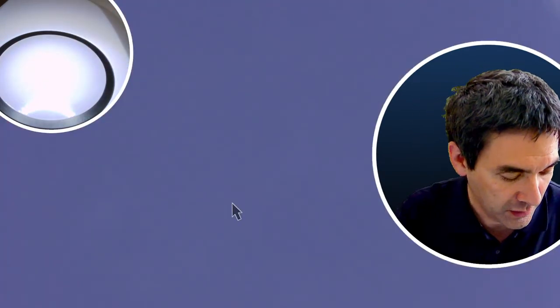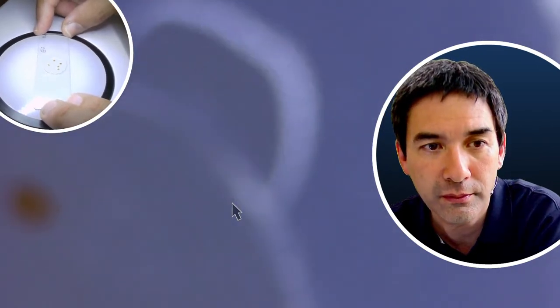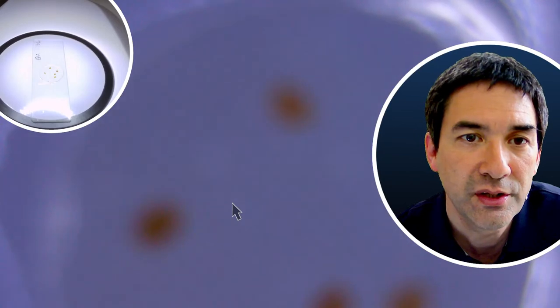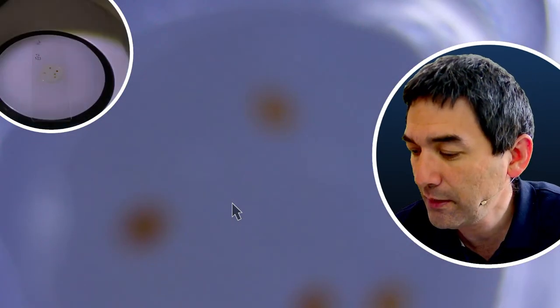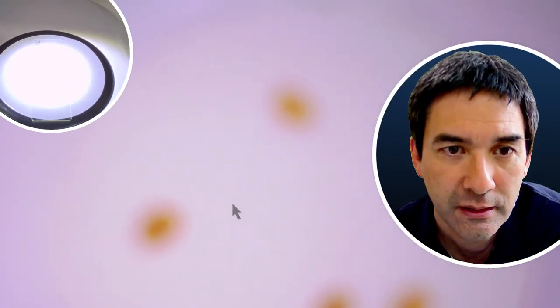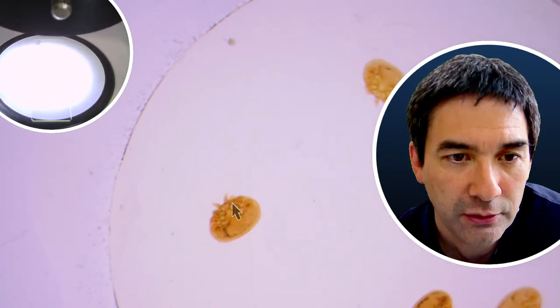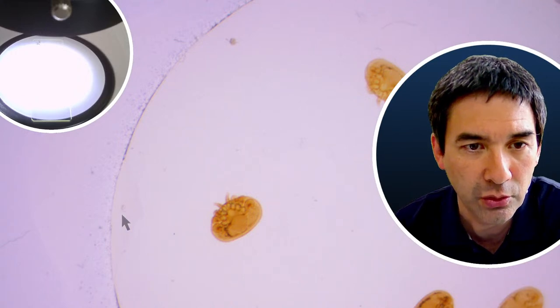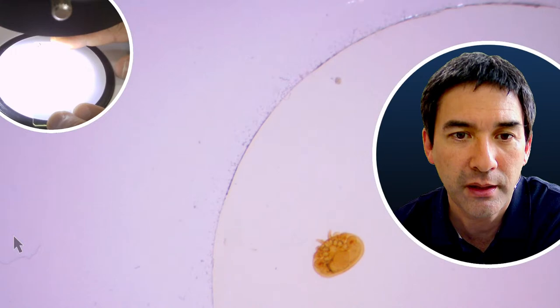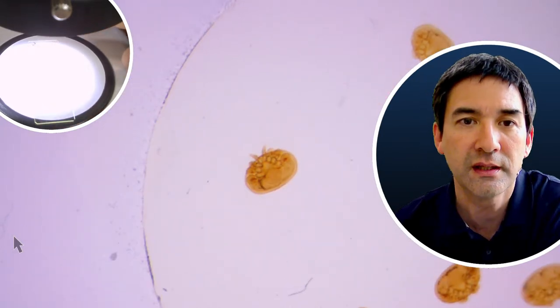Today I would like to observe some slides — specifically Varroa mites that I made into slides a couple of months ago. Mites are related to spiders — not spiders, but related. I got them as a present from a student who had a beehive; these are bee parasites. I would like to show them under the stereo microscope and then look at them under the compound microscope so you can see a little bit of the difference. This live stream is also a nice demonstration of what the difference between magnification and resolution means.